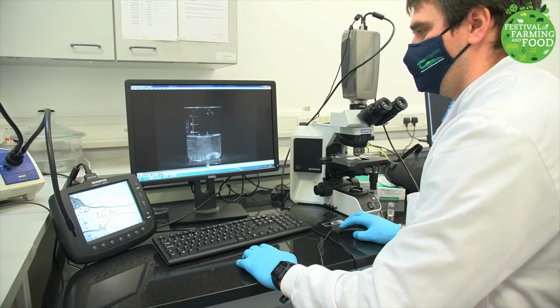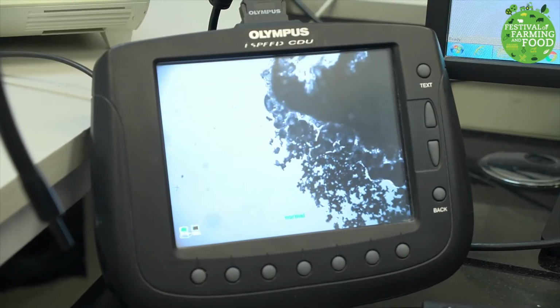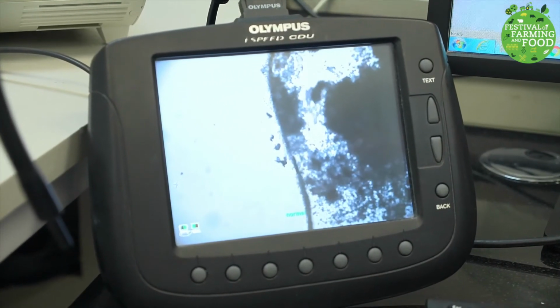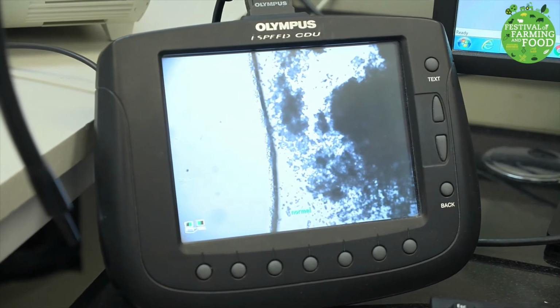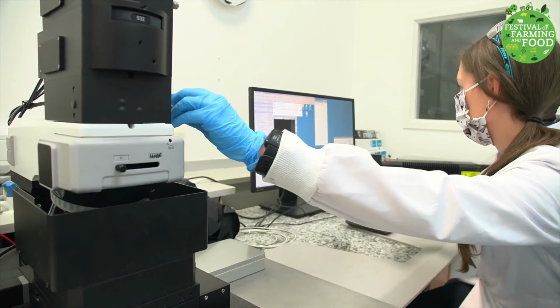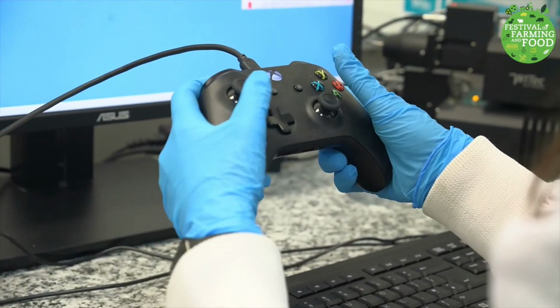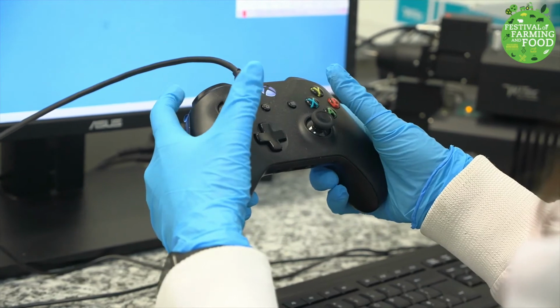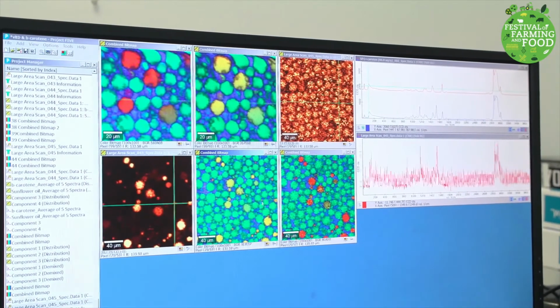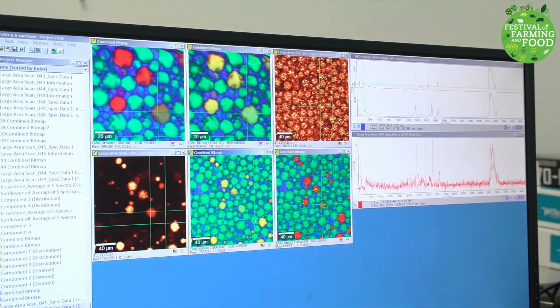We have a high-speed camera that can film up to 100,000 frames per second. We use this to look at fast processes in slow motion, like tracking how a powder particle dissolves in water. We can play detective with equipment that can identify individual components such as contaminants. We can scan a food and identify all components by their chemical fingerprints. This allows us to trace contaminants, identify functional ingredients, and track where all components are located in a food, telling us so much about what our food is made up of and in what way.